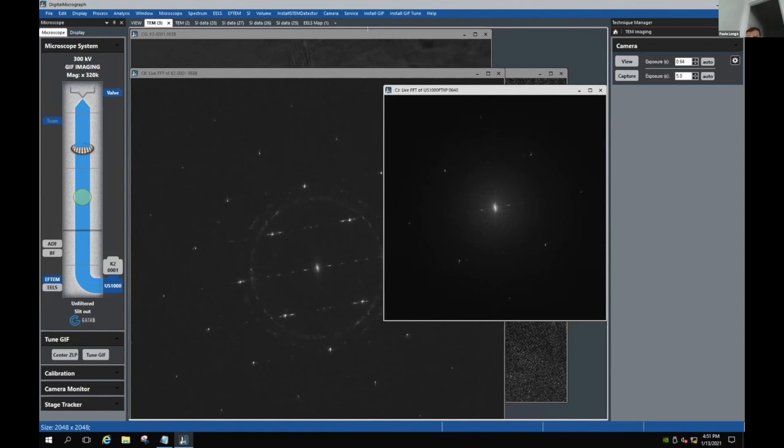But I think you can help. Well, I don't know that you can help with that aspect, but I think you can help very much with making sure that the microscope's in the right condition and that we're collecting with the minimum dose. It really depends on how big your MOF structure is, how many particles you have, and how many are on zone. Also how flat the particles are. There are a lot of conditions.